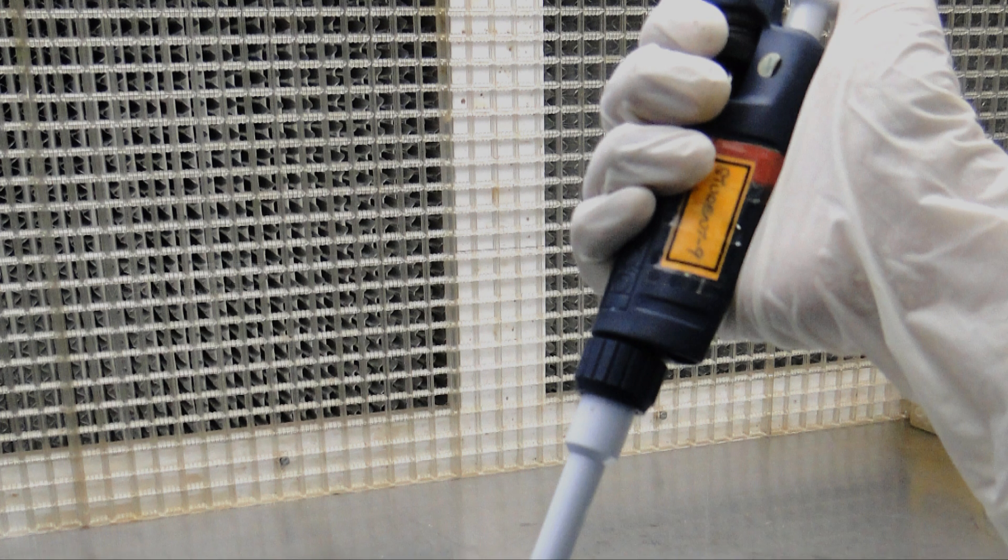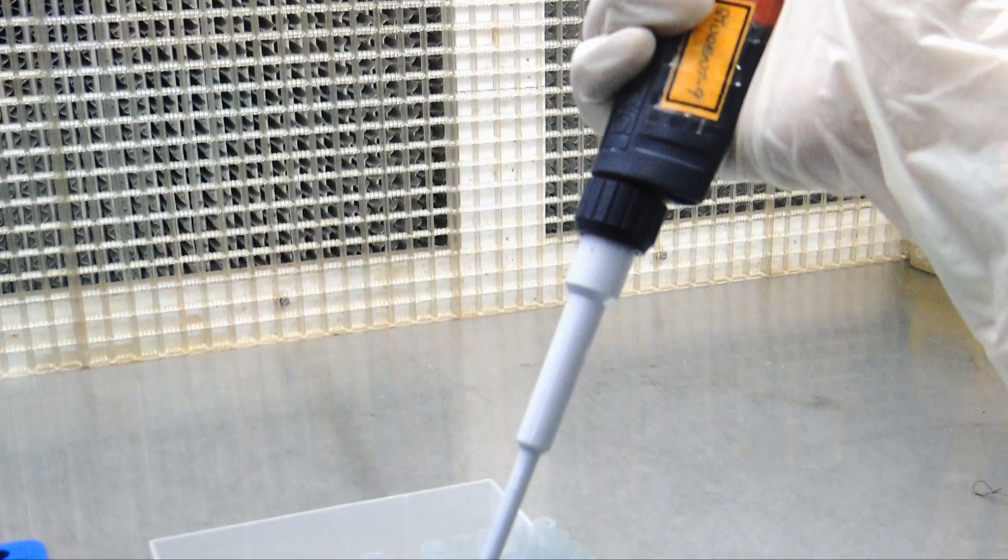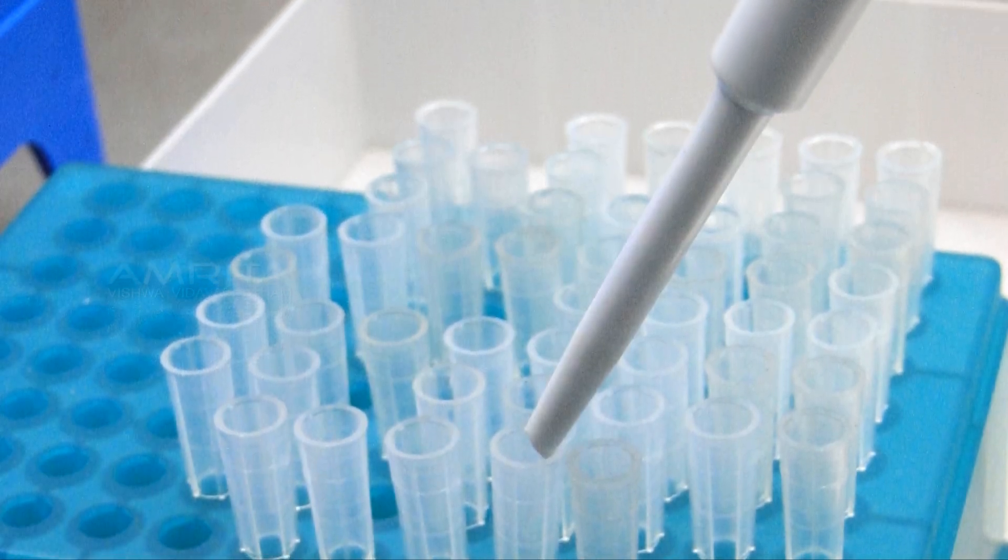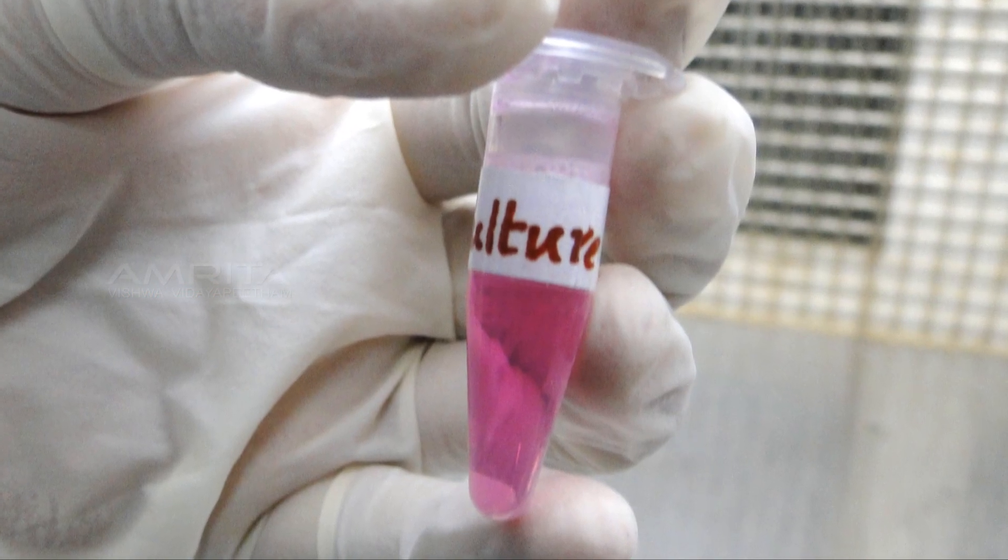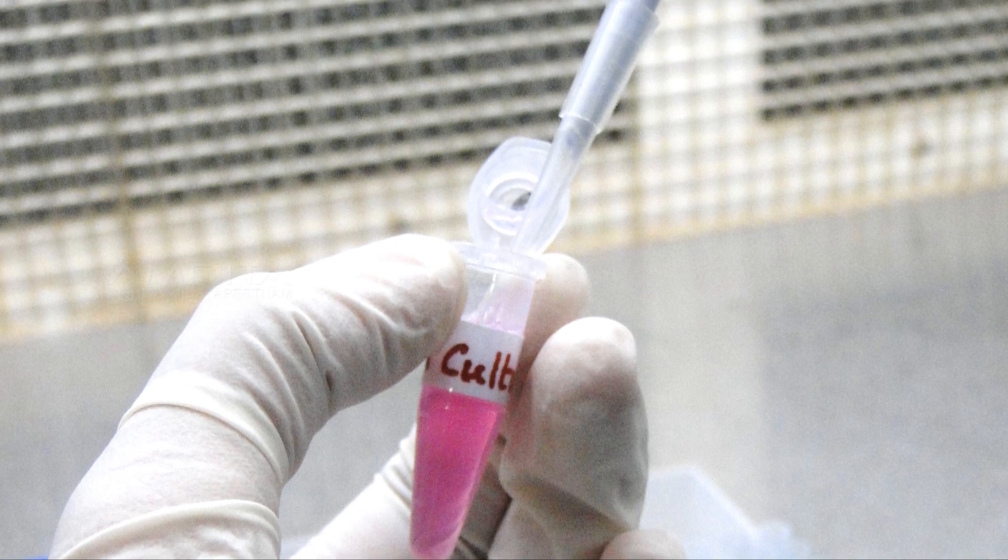Procedure: Set the micro pipette scale to 10 microliters. Insert a new micro pipette tip to the micro pipette. Take the vial containing uniform cell suspension, open it, and mix it 2-3 times with the micro pipette.